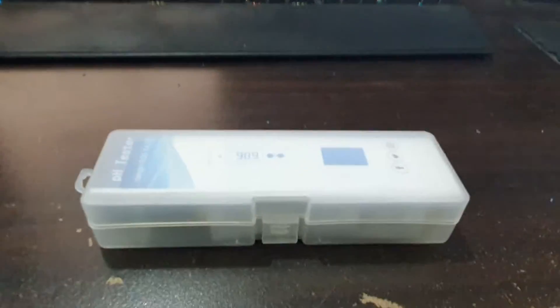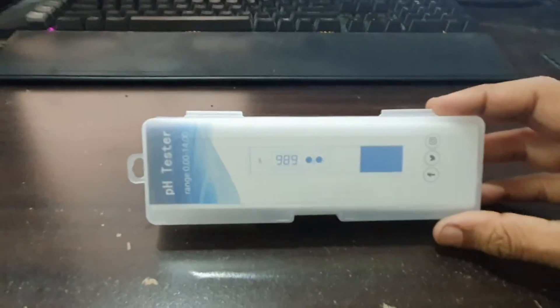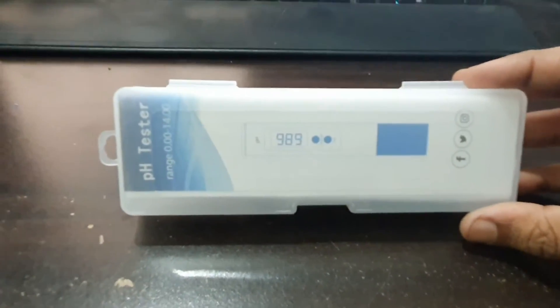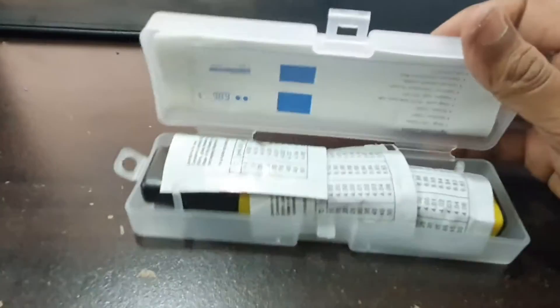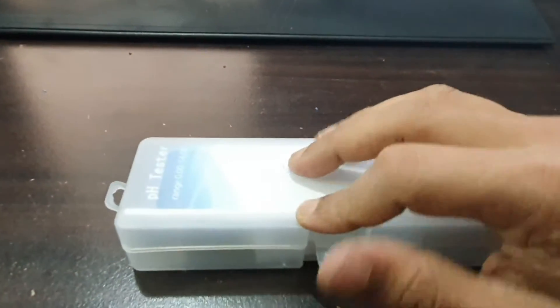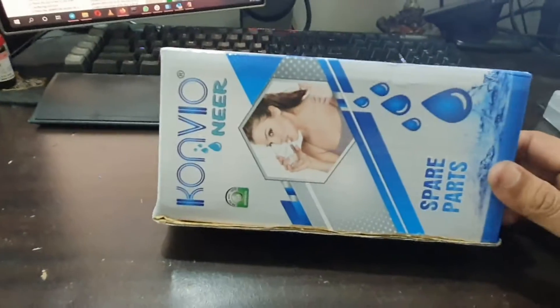Hi friends, previously I made a video on the unboxing and review of a pH meter. I haven't done the calibration video yet, which I'll be doing shortly. But today we are going to look at a different product from Convio — the Convio NIR.